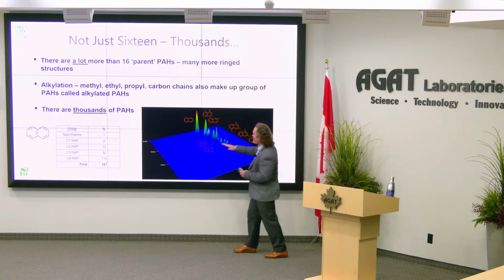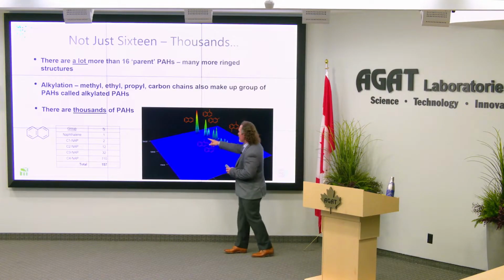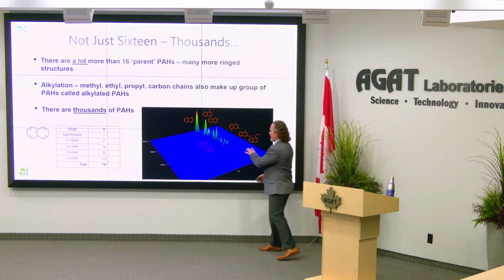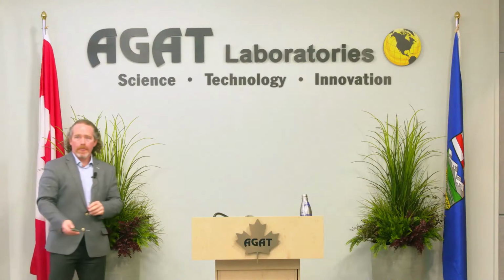And so you can imagine the environmental forensics that's capable with something like this as opposed to just the 16 or even the alkylated. We can get pretty sophisticated in our pattern recognition. And that's where the world's going. Probably needs another 10, 15 years, but this is when we can handle this type of data, process this data, and look for similarities, that's where it's going to end up.